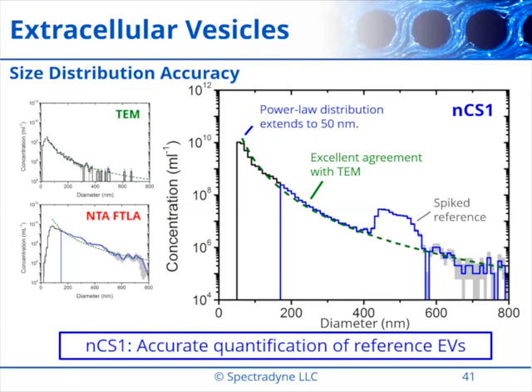Anyway, so you see the peak from the beads, but we get very good agreement lower down, again, basically down to 50 nanometers. So accurate quantification of these reference EVs.